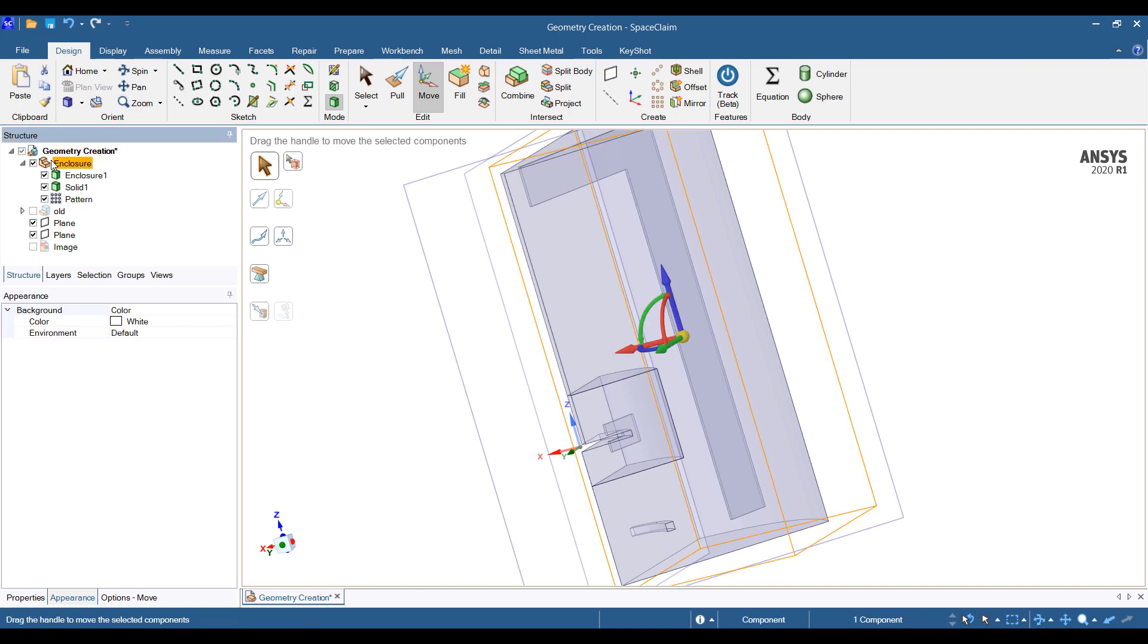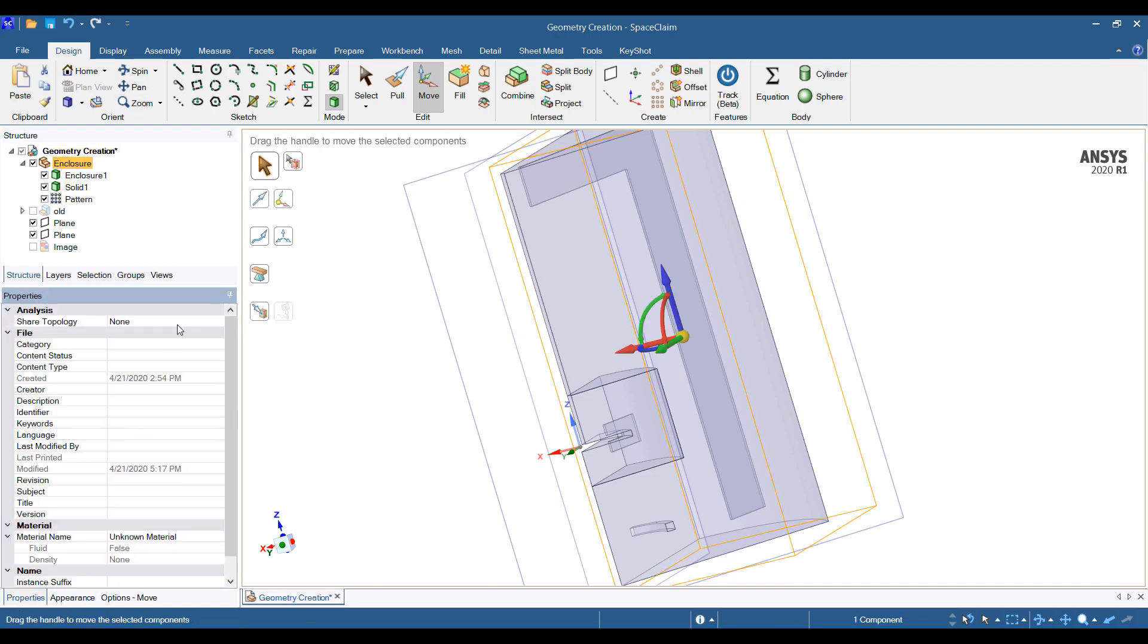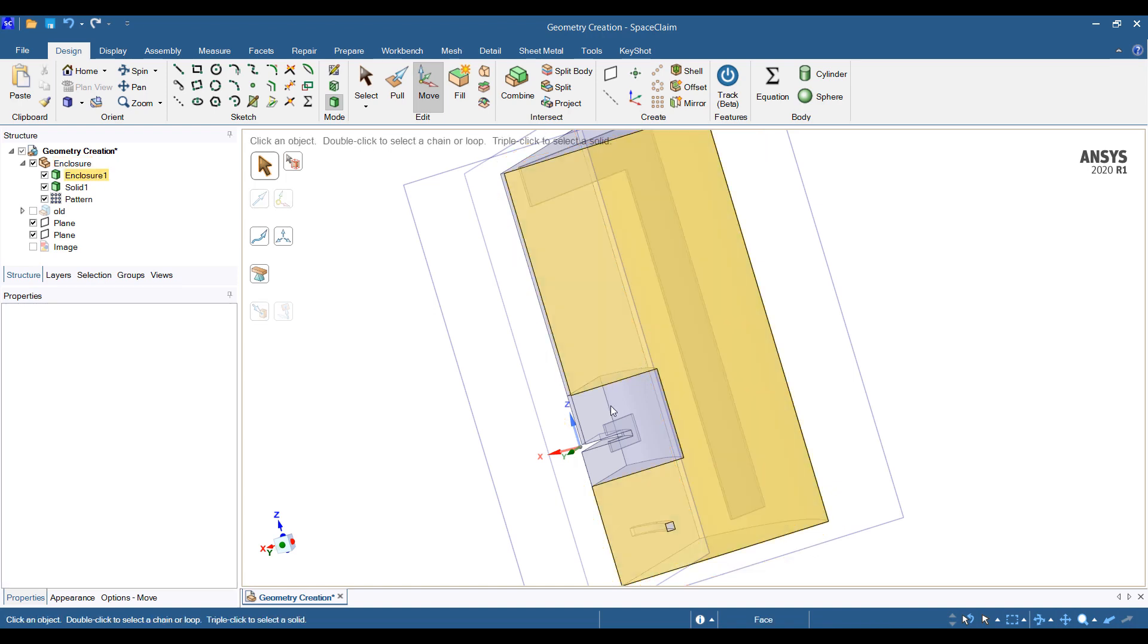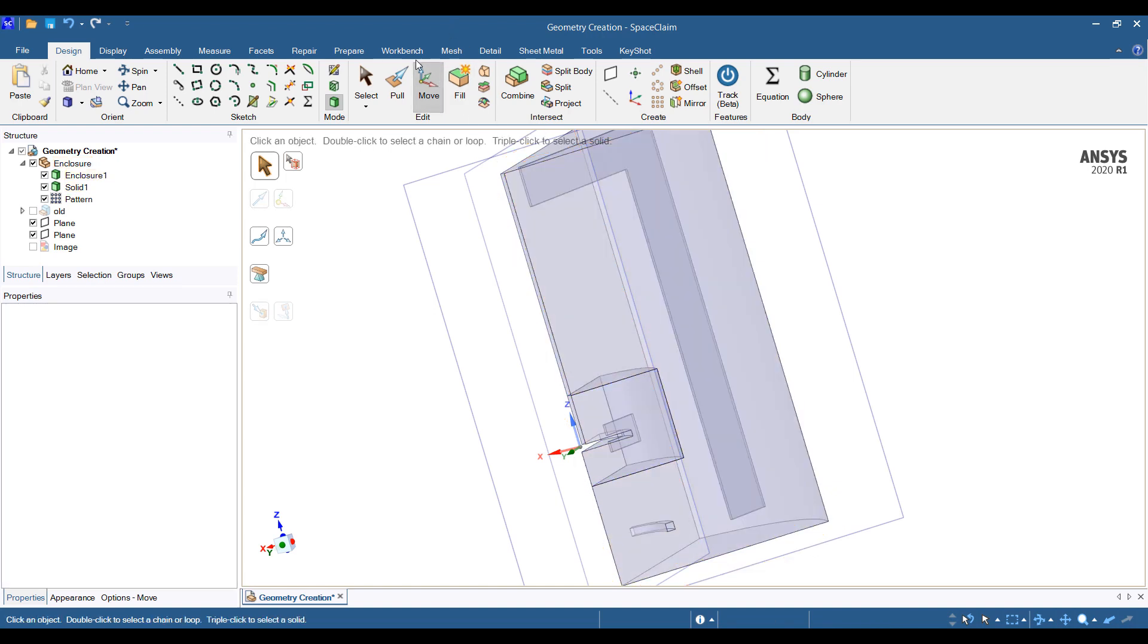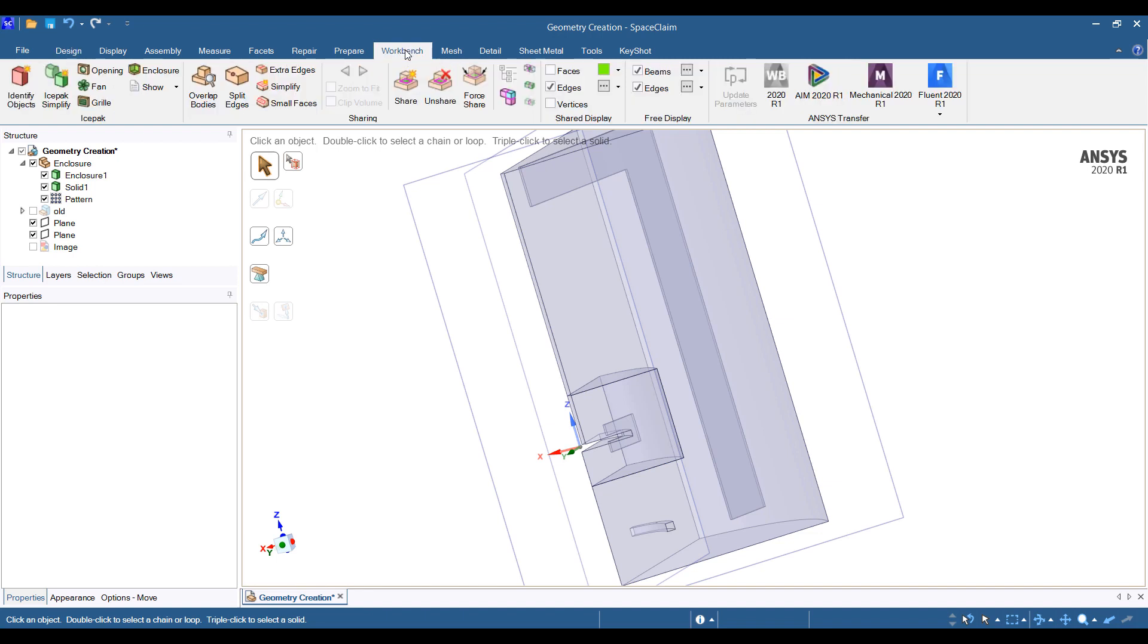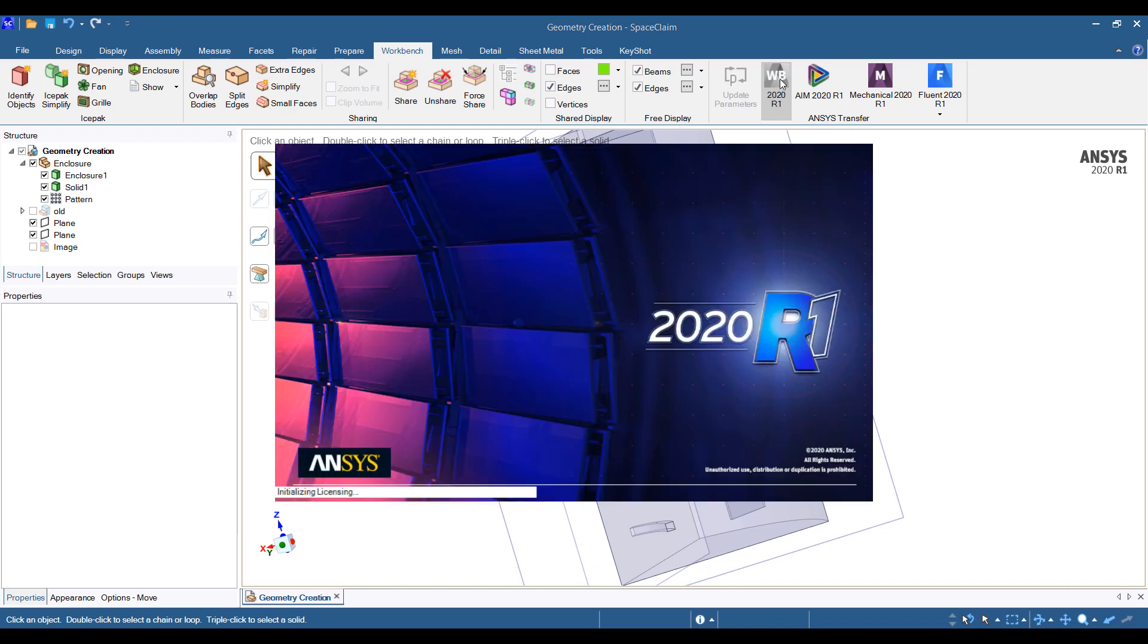One thing I forgot to show last time was that we do want to have shared topology turned on. This allows us to make sure that the meshes match up at interfaces. It's not completely necessary, but it's helpful to get this done. So let's save this and go into Workbench.